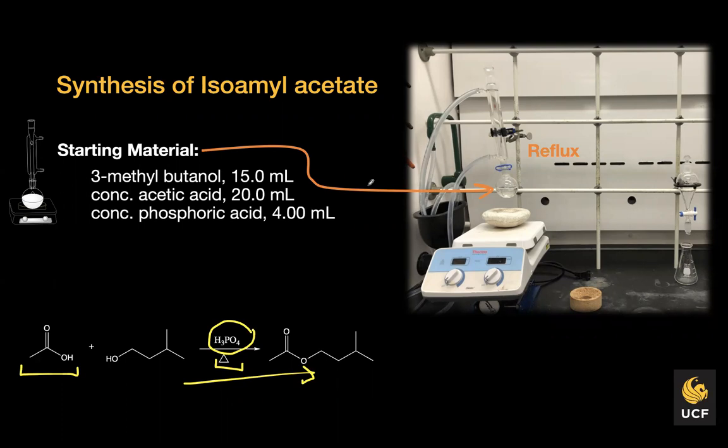And the idea is that we'll end up raising the jack so that the heating mantle is really surrounding that round bottom flask. The reaction is being heated up, and it will start condensing right within the round bottom flask. So the idea of reflux is that you can heat the reaction mixture without evaporating any of the solvent or any of the molecules that are volatile, right?